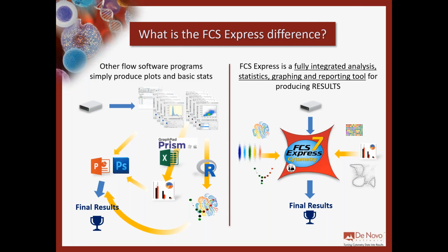So this way of doing things is not efficient. It's time consuming. It cannot be automated. If you have to perform the same experiment twice, you need to go through all these unneeded steps again. And what if your boss asks you to change a gate in your analysis part? Then you need to do this again, and again. So it's time consuming, it's not efficient.